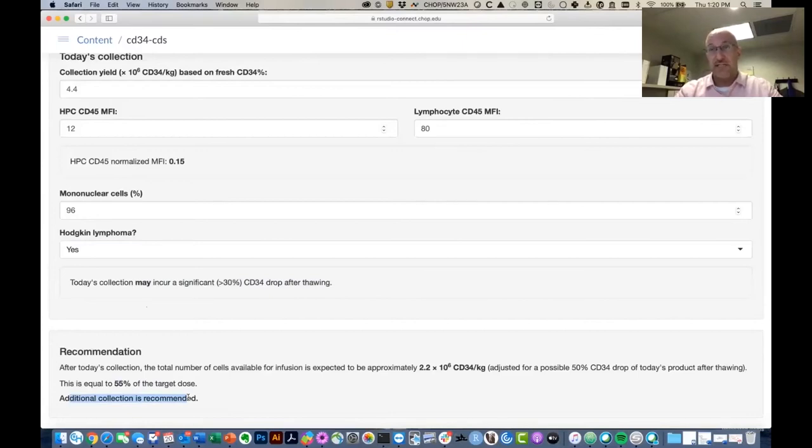So this is pure money saved by the hospital, 10 days saved of CLABSI risk. So this is an example, I think, of where me knowing how to write an app in R and implement an algorithm really enabled us to move quickly on translating a research finding into practice, potentially resulting in significant savings and potentially risk reduction.